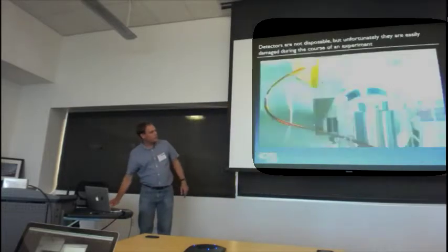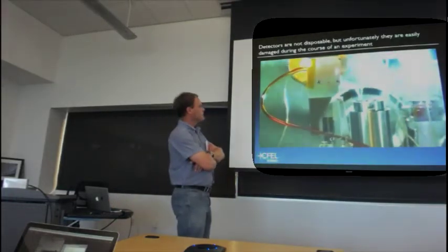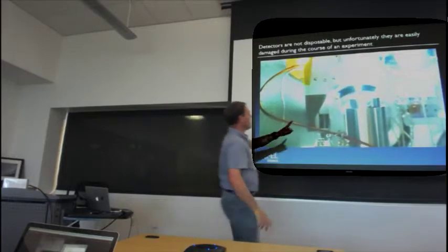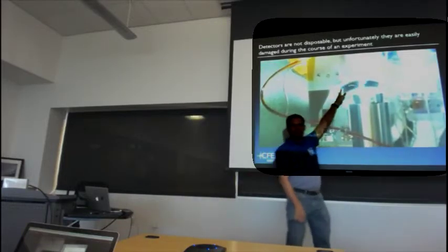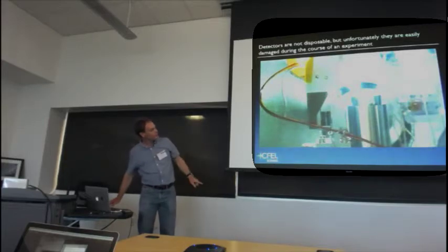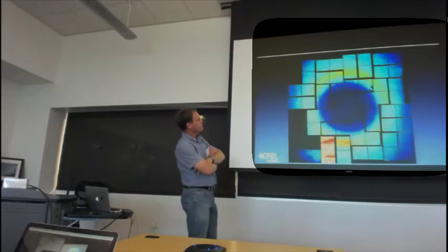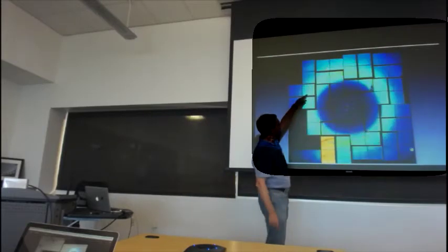So I talk about damage to the detector. This is a not so enlightening event. It was sample being delivered, and you have ice growing up here. We moderately regularly destroy detectors, it turns out, through mistakes like this. So here's an example of what it's like when you're shooting that. You get these huge Bragg peaks from the ice.